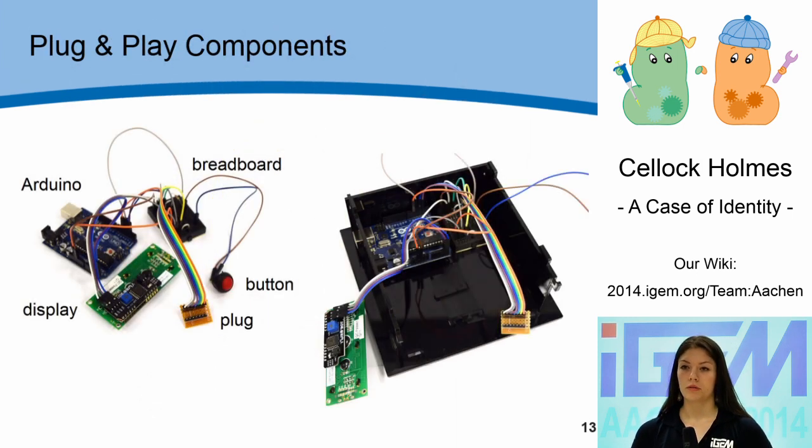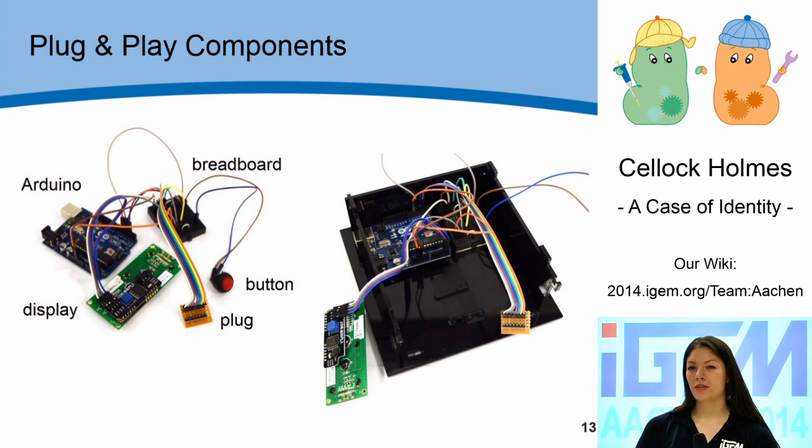Let's have a look at the wiring. To control our device, we use an Arduino microcontroller connected to the button, the plug, and the display via a breadboard. The control unit is located at the back of the device, leaving space in the front for the cuvette holder. When you attach the display to the lid and close the casing, you get the finished OD device.